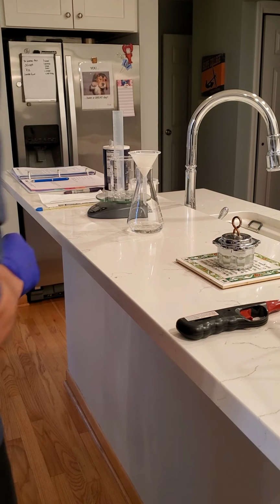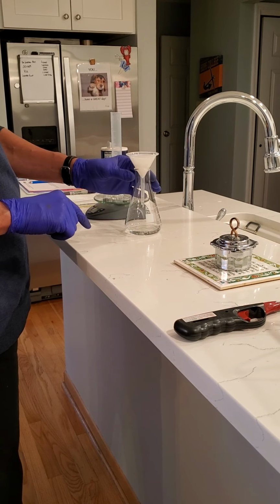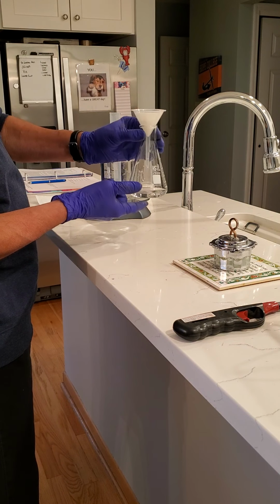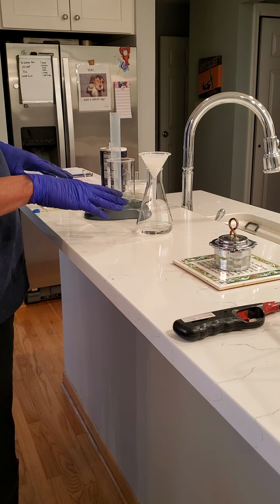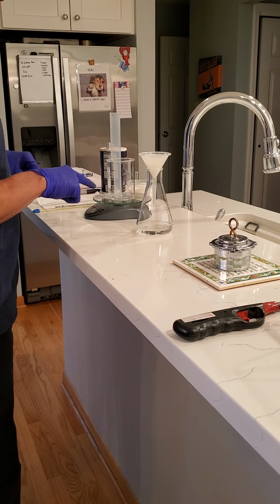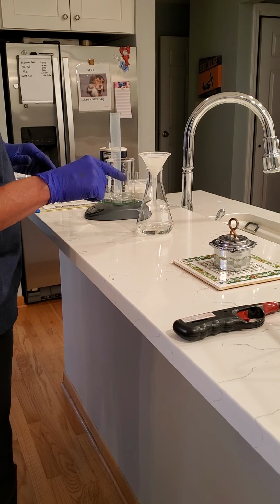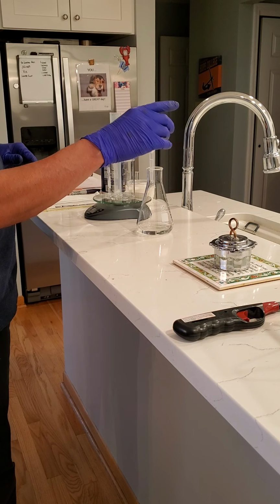Okay, class, we're just about done filtering. We've collected now about 40 or 50 mils of filtrate of the saturated solution of sodium chloride in tap water. To begin with, we're going to add this liquid to a beaker that's been pre-weighed. My beaker I just weighed is at 4.1 grams, so I've recorded that in my lab notes. And now that we've filtered this, we're going to take a known weight of our solution and add it to the beaker.